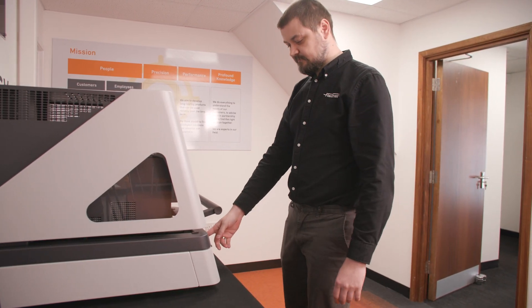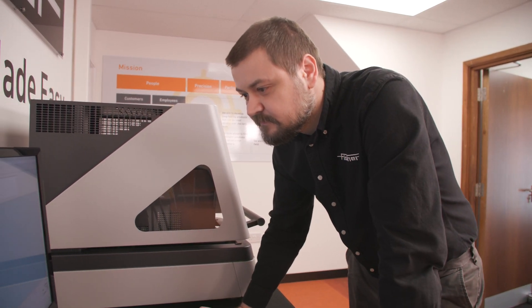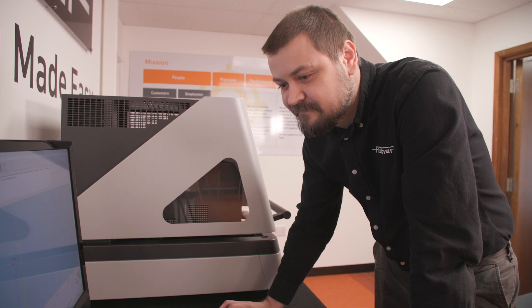In summary, the FischerScope X-ray XDAL-237 is an easy-to-use, highly-precise tool for automated measurements of thin and very thin layers less than 0.05 µm, and for material analysis in the parts per million range.